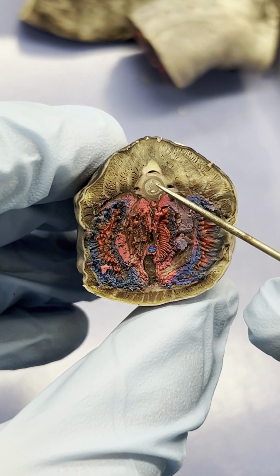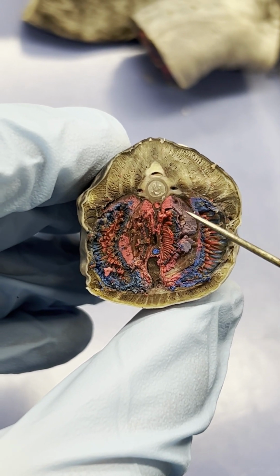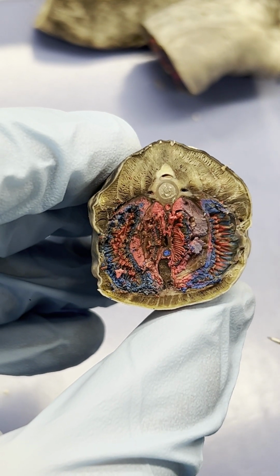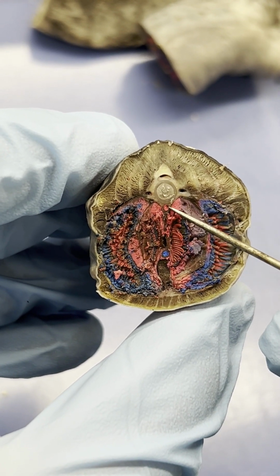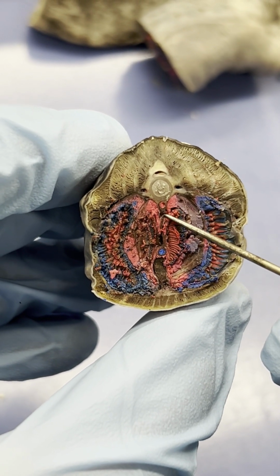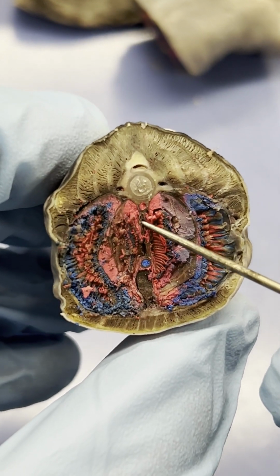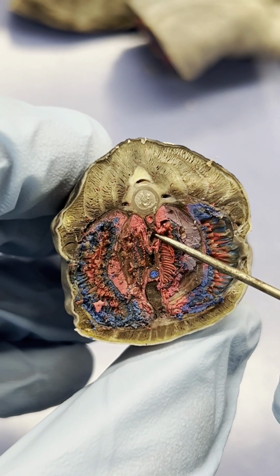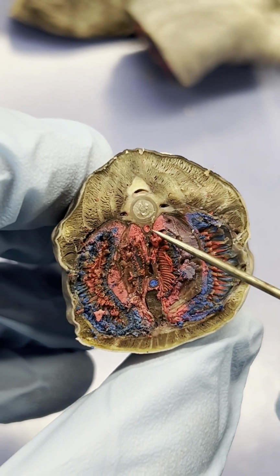We have our notochord, which is right here. We have our anterior cardinal veins here and here. Dorsal aorta right there. We have the esophagus, which will be this opening right under the dorsal aorta.